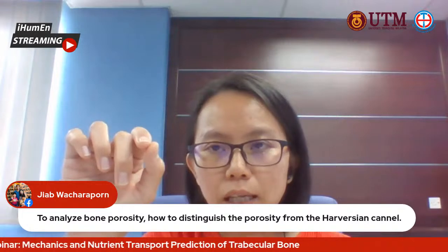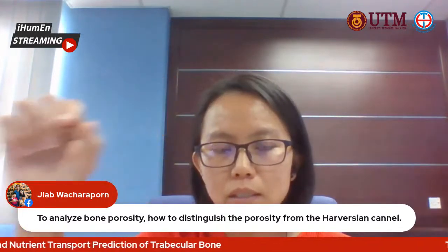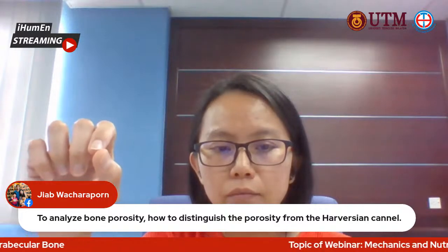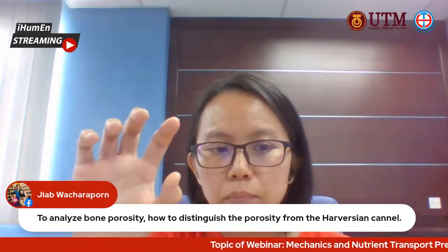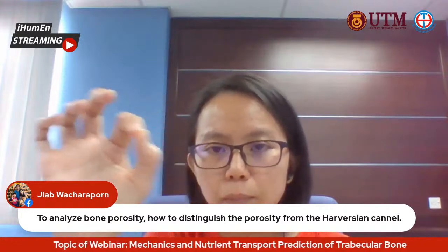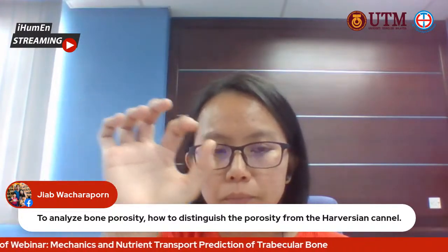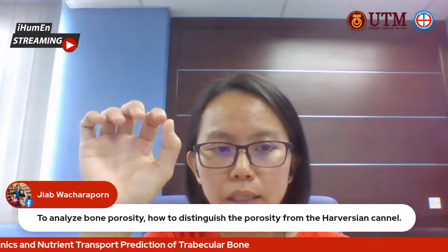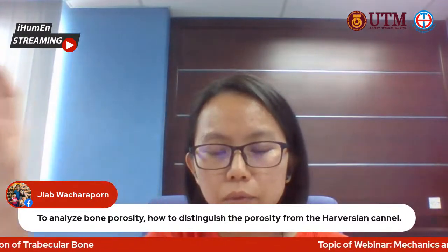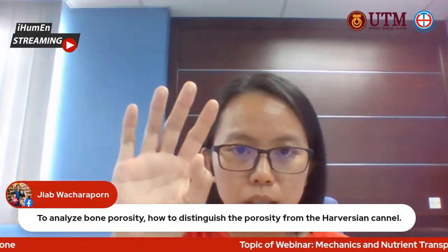But the Haversian canal is a tube shape, and you can see all the networks built up and connected to each other. For cortical bone porosity, you can see the irregular shape of the pores. So from the different morphology, you can tell whether it is the original porosity of the bone, or whether it's from the canal, or from the osteoblast cells.